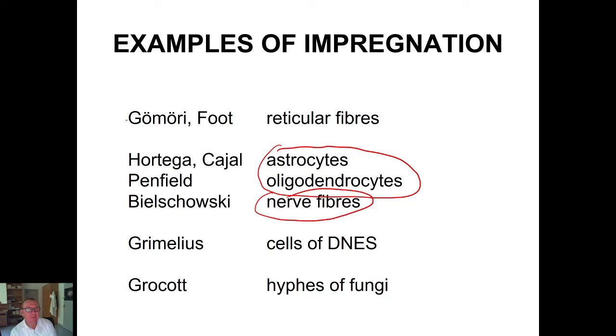I would like you to remember Gömöri. He was a Hungarian scientist, but he lived mostly in the United States, and so you maybe can find his name with another pronunciation, but the original is the Hungarian pronunciation Gömöri, and his impregnation stains reticular fibers.